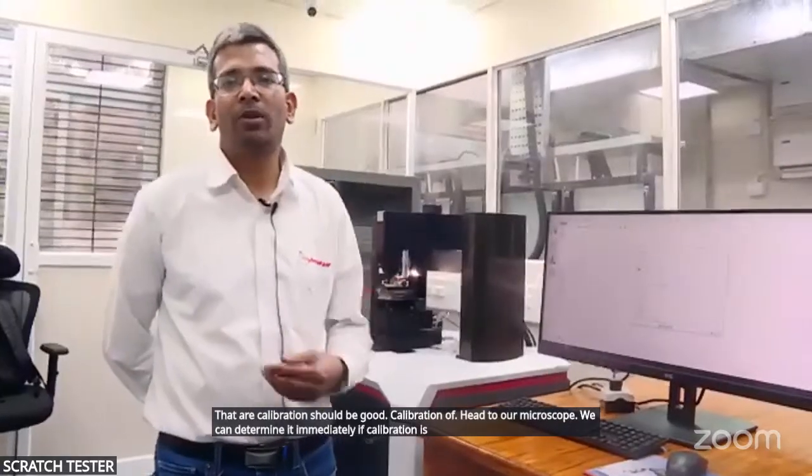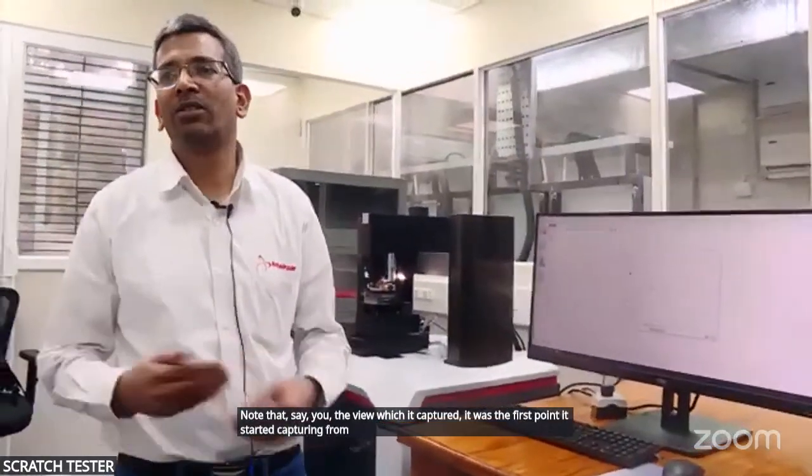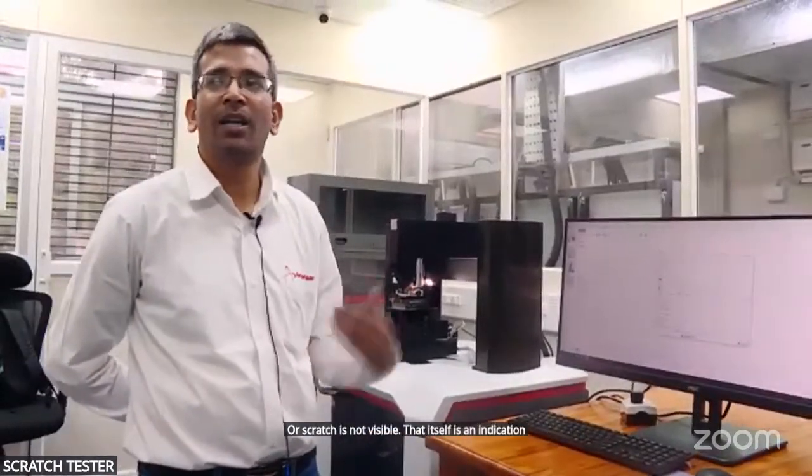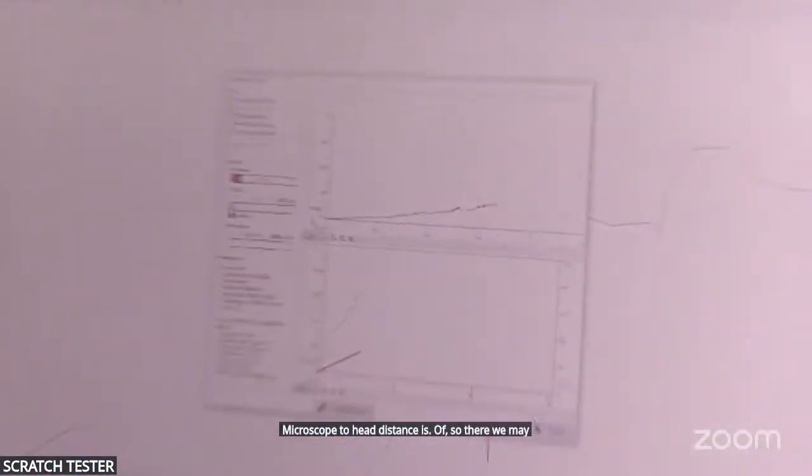For example, I am doing a scratch and I see my scratch starting point is not the view which it captured, it started capturing from a chipping point or somewhere else, or the scratch is not visible. That itself is an indication that my microscope to head distance is off. So there we need to do this calibration again.